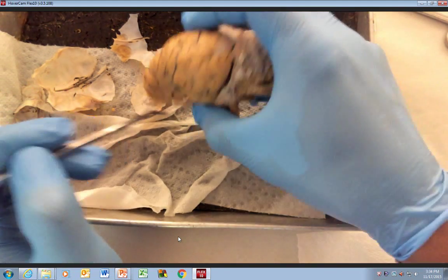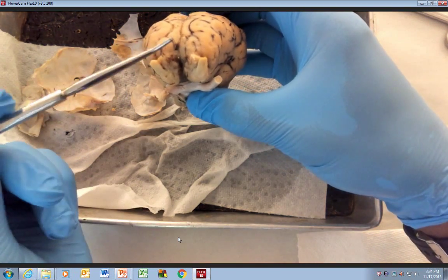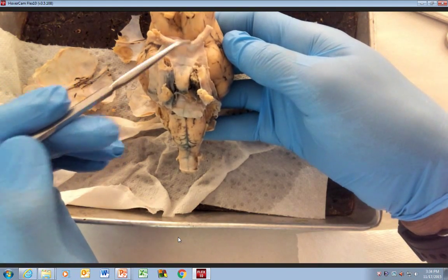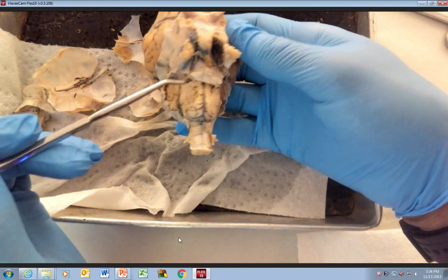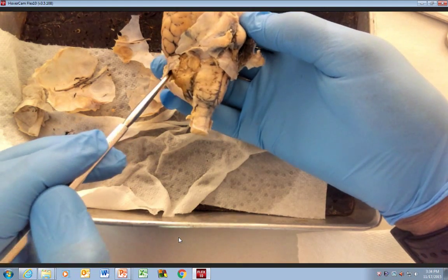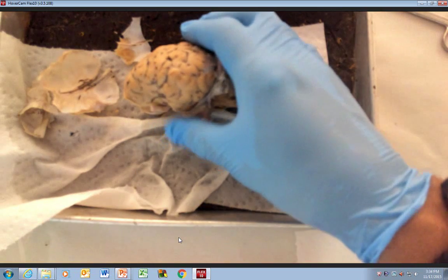We're going to switch views. This is an anterior view; this would be an inferior view. You can see the optic chiasma. This is the optic nerve — cranial nerve number two. And then you can see down here the pons, the medulla oblongata, and the cerebellum.